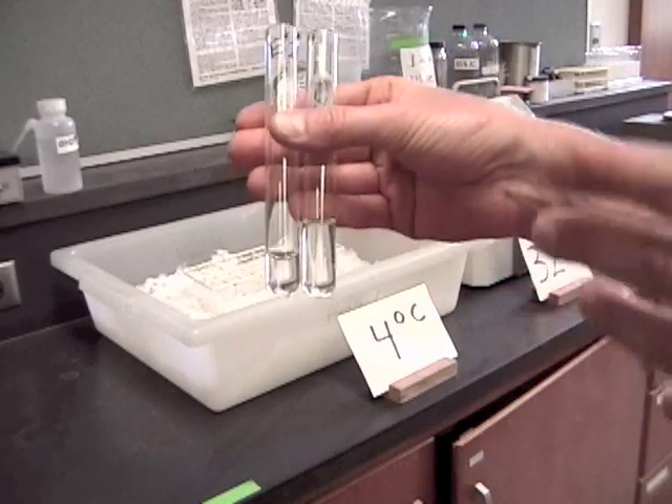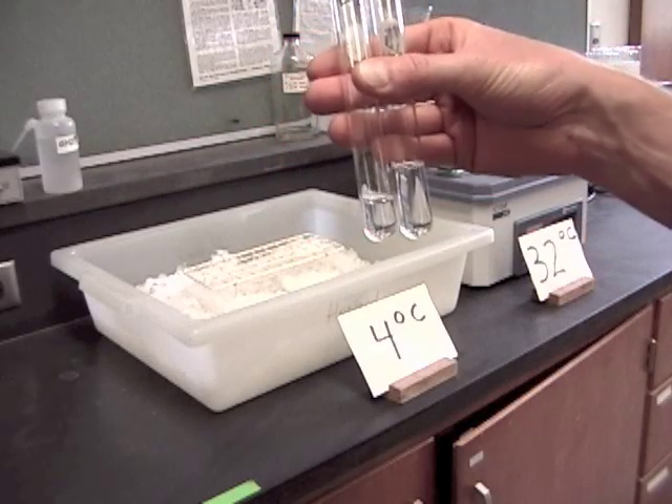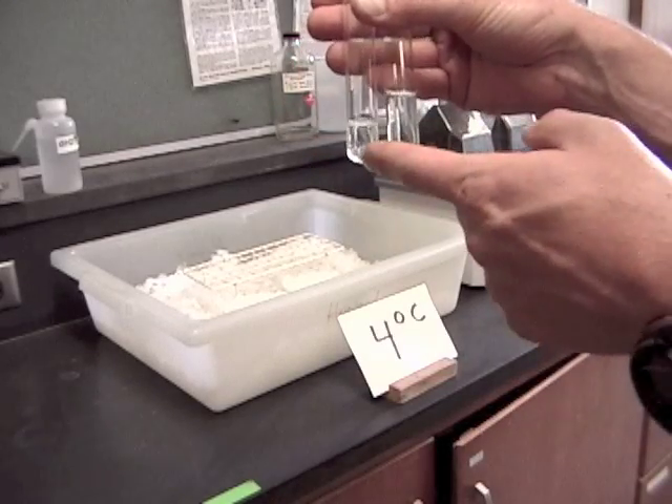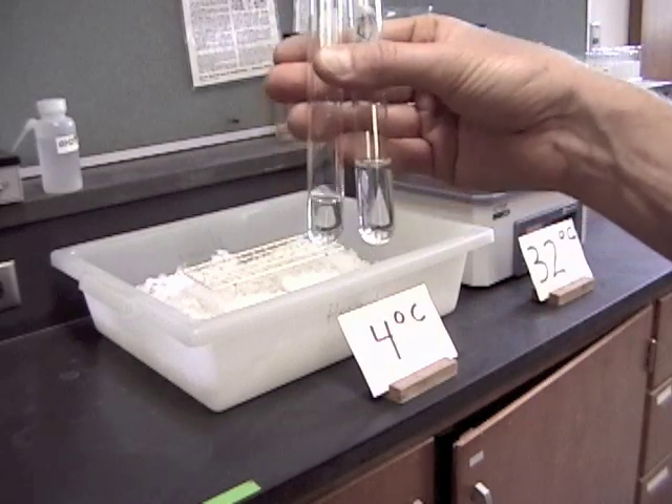Back at my bench, my group and I mixed up our reagents in our labeled tubes. Here I have tube 2 and tube 3 for the temperature experiment. One of them should have about 3 mils in it, the other one should have about 5 mils. Make sure you look at it and test to make sure you've got the right amount in there.